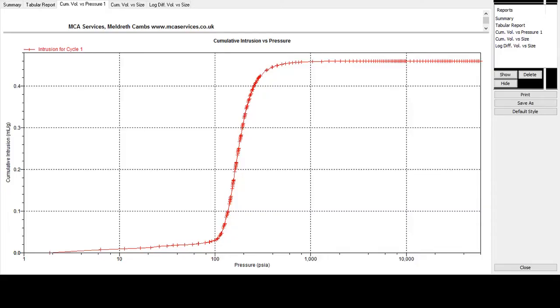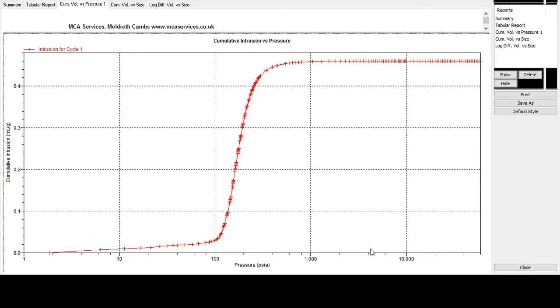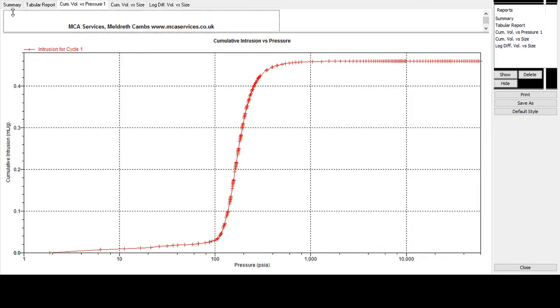So our analysis has now finished. We've just recorded the intrusion data here, but essentially the extrusion process is exactly the same as the high pressure intrusion analysis, only in reverse. So the last thing to do is generate a set of reports for this sample. And we've got a standard set of reporting data from each of our analytical options here. And some of these graphs and some of the summary data should be familiar to some of you.